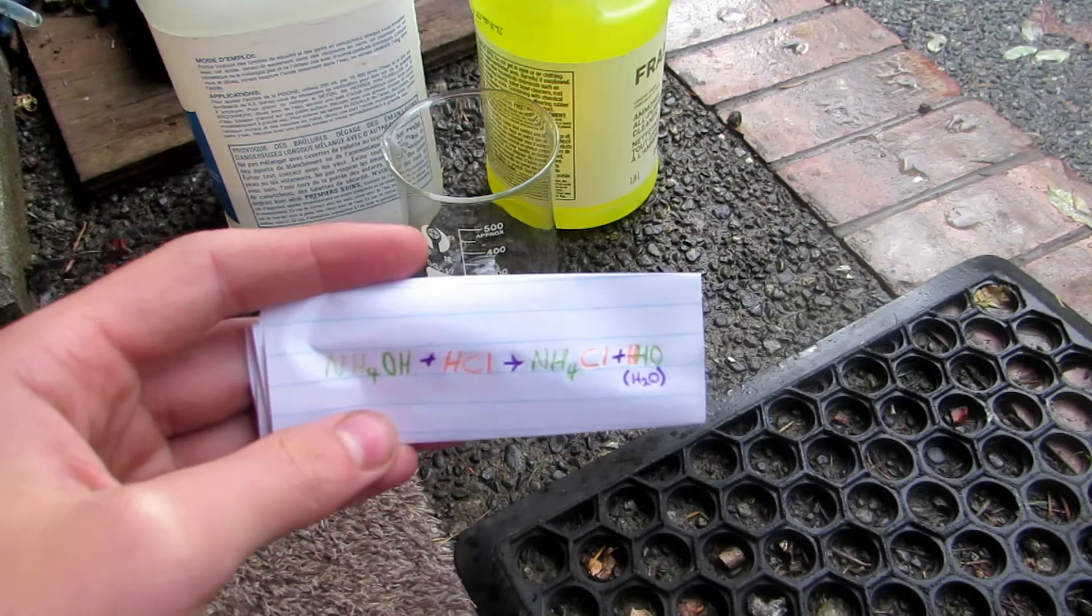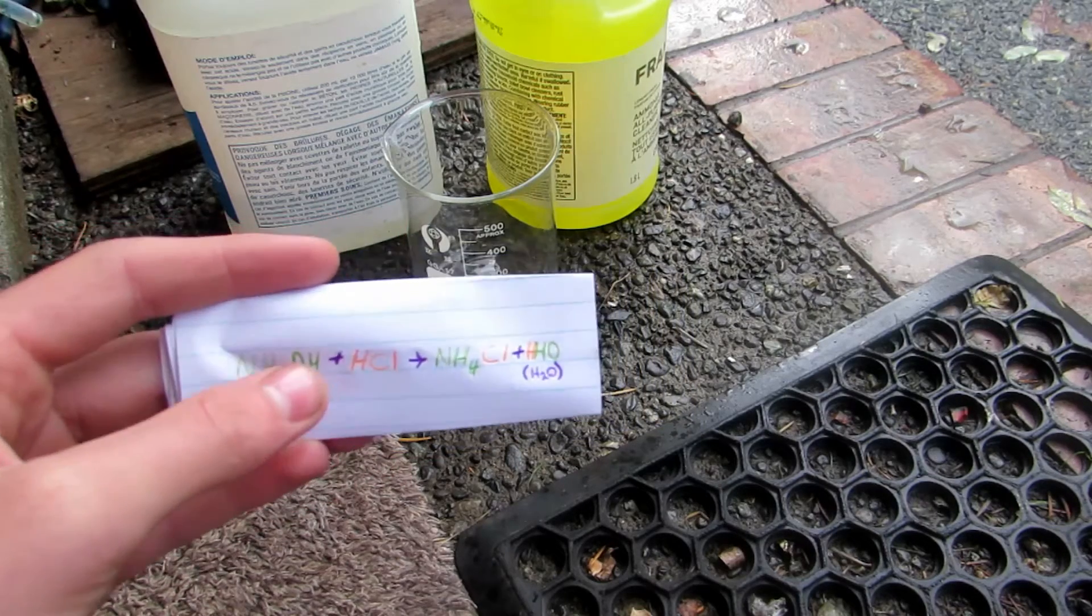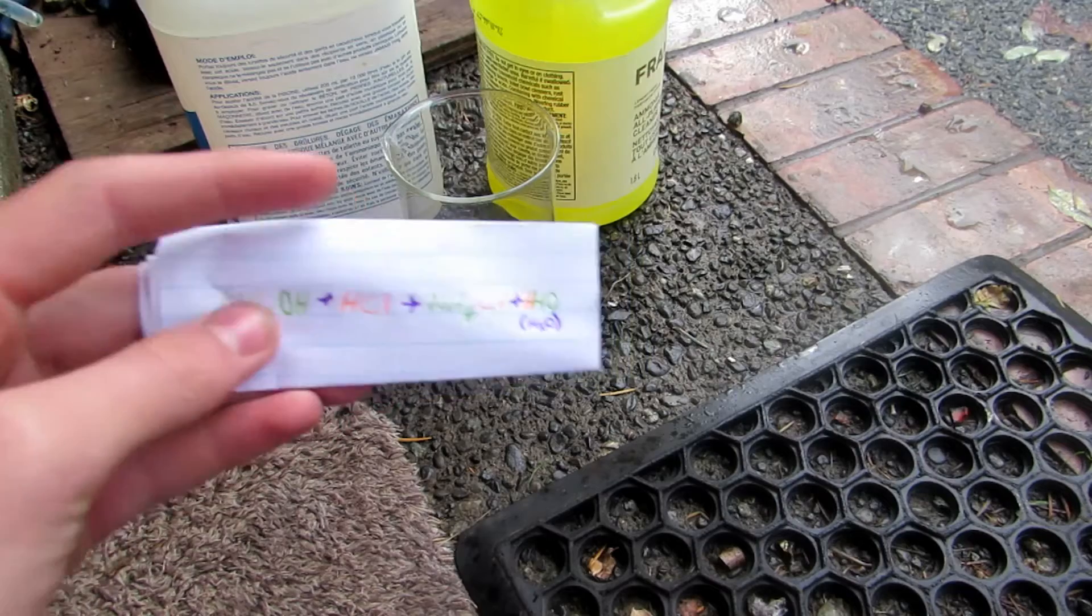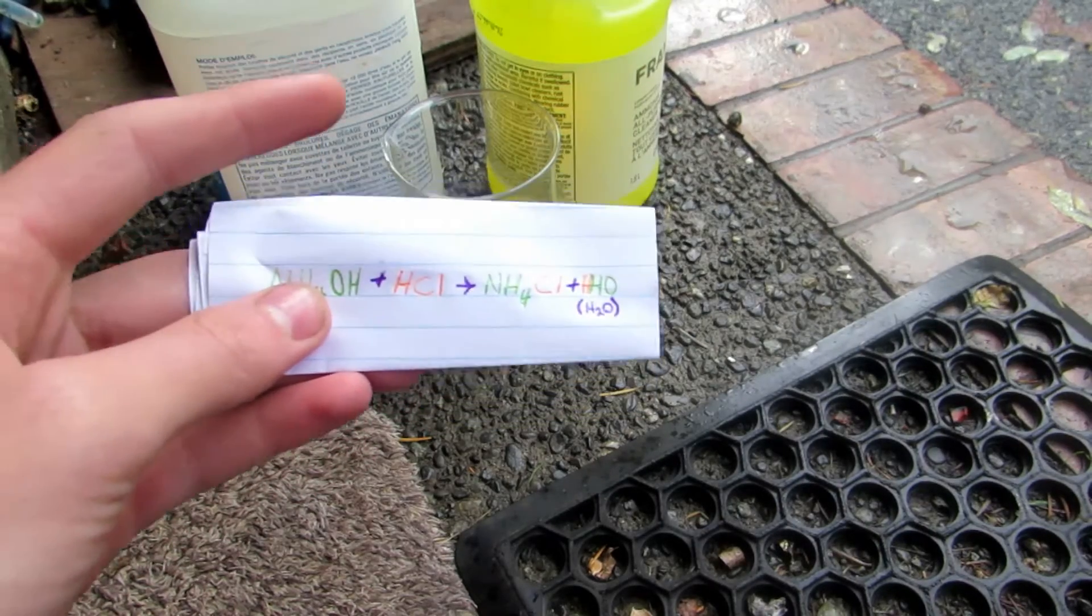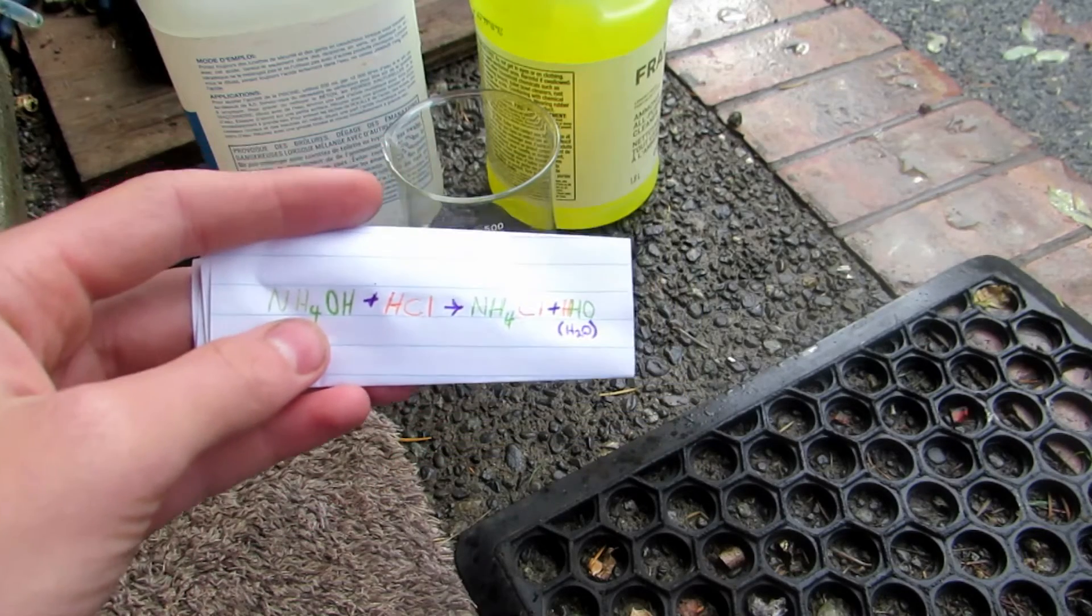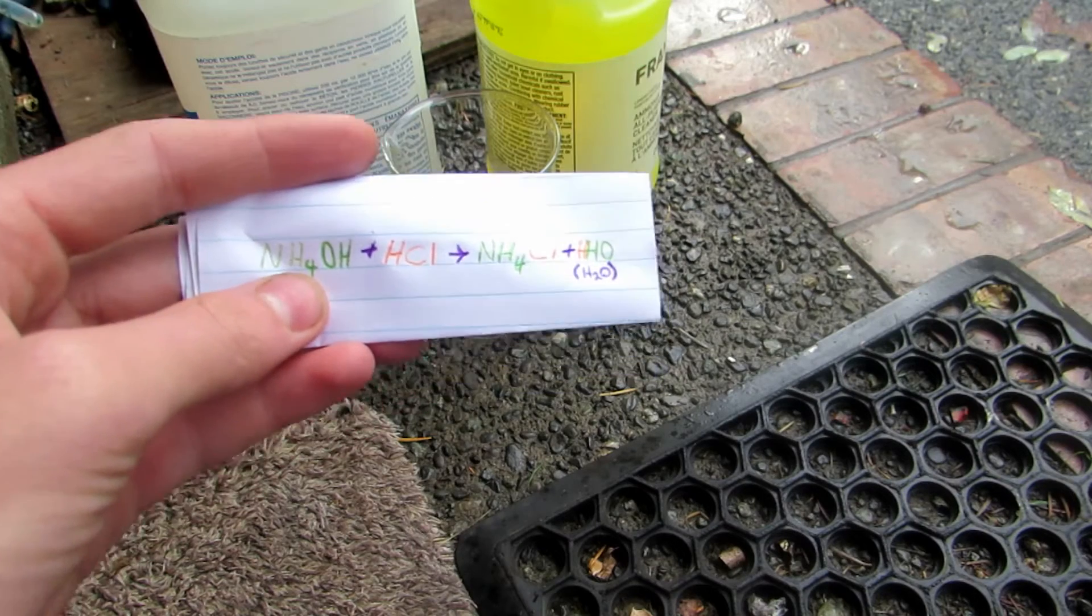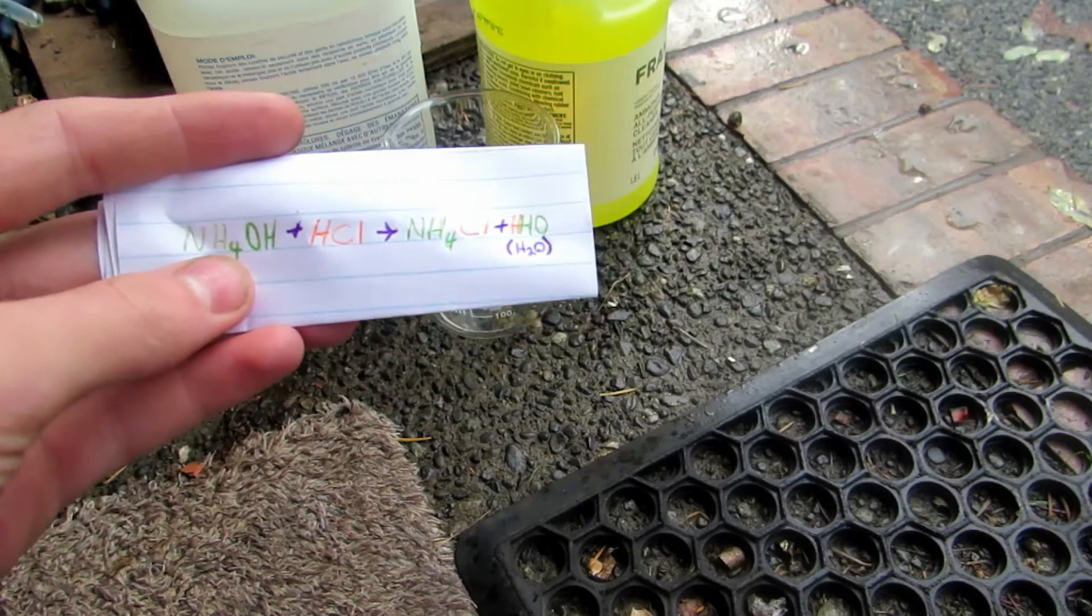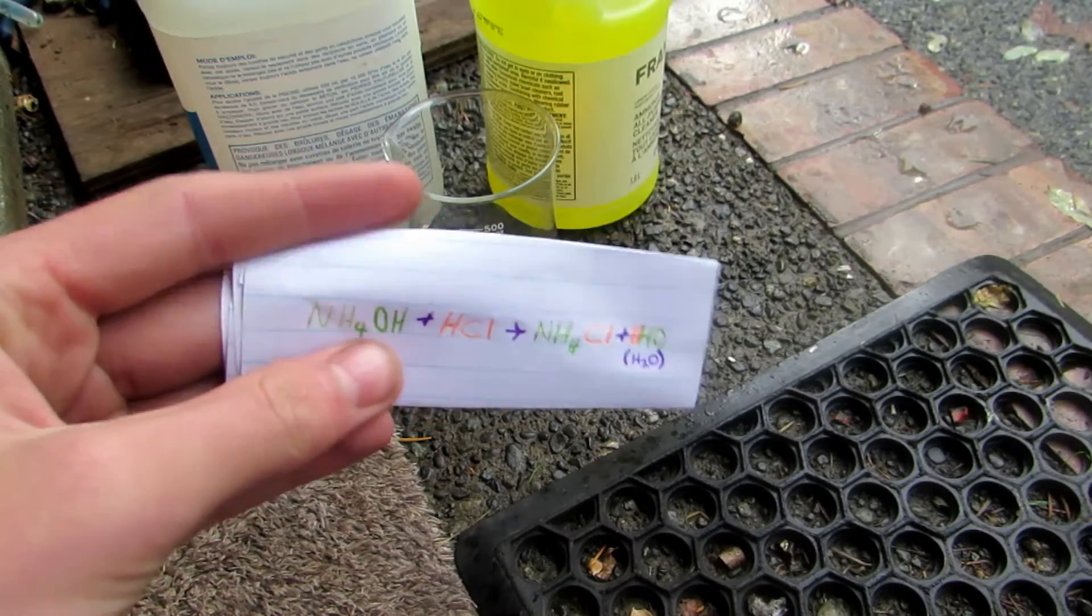Hey guys and welcome back to another video. Today we will be making ammonium chloride. Ammonium chloride for our uses is mainly going to be used as a source of ammonia gas if we ever need it. I'm also going to be reacting it with sodium nitrate to form nitrous oxide or dinitrogen monoxide, which is essentially laughing gas. However, this is going to be for the reaction of the barking dog.